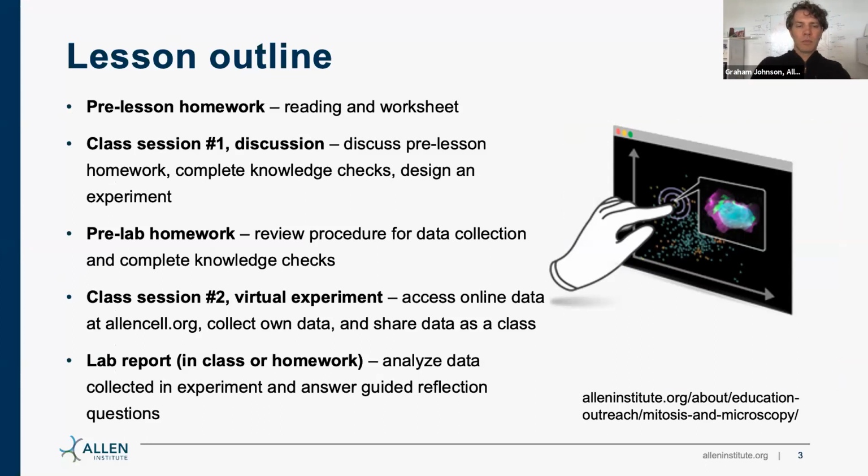And then in what is intended to be the second class session, they collect the data, and then either in class or as homework, complete another worksheet that guides them through reflecting on the data and analyzing the data that they've collected. Again, all of these pieces are flexible. They can be assigned entirely as homework or run entirely in class. You can modify or replace sessions as needed to fit your class and to fit your distance learning needs, but I'm gonna walk through it as written.